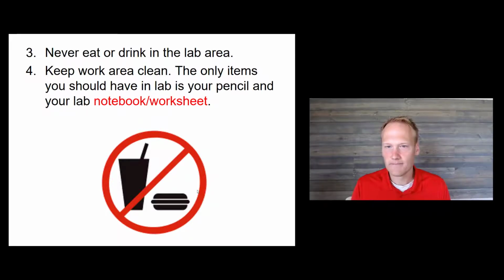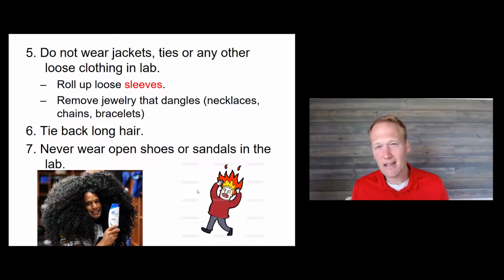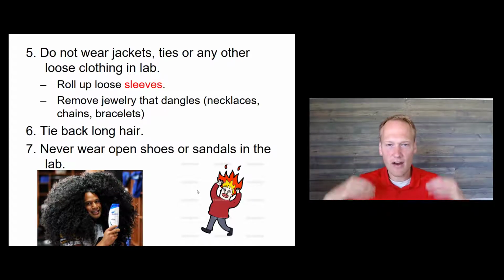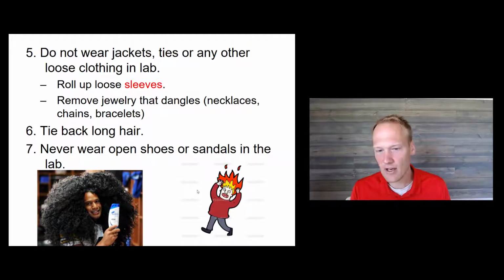That would be okay. On lab days, we don't want to wear any loose sleeves or jackets that, if you were reaching across the lab bench, you might accidentally catch on fire if we're using a Bunsen burner. Same thing with jewelry that's hanging down. If you lean over, that could create a problem. Hair is also an issue. We want to tie back loose hair if you have long hair, or even just push it behind your shoulders, to make sure that when you're leaning over, it's not falling into a solution or getting near a Bunsen burner.